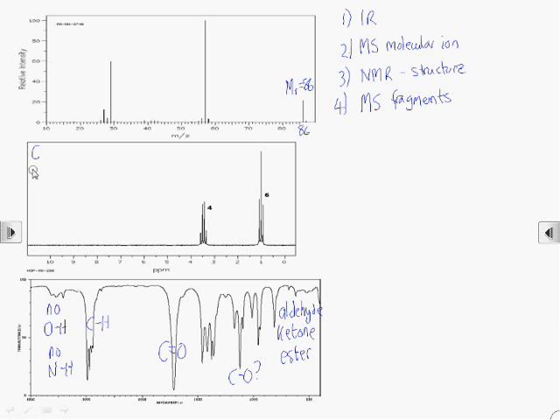And now we need to start working our way through the NMR. We'll be systematic about this. We're going to start with the context. We know this is an aldehyde or a ketone or an ester. And then take a look at the number of proton environments. There are clearly two proton environments here.